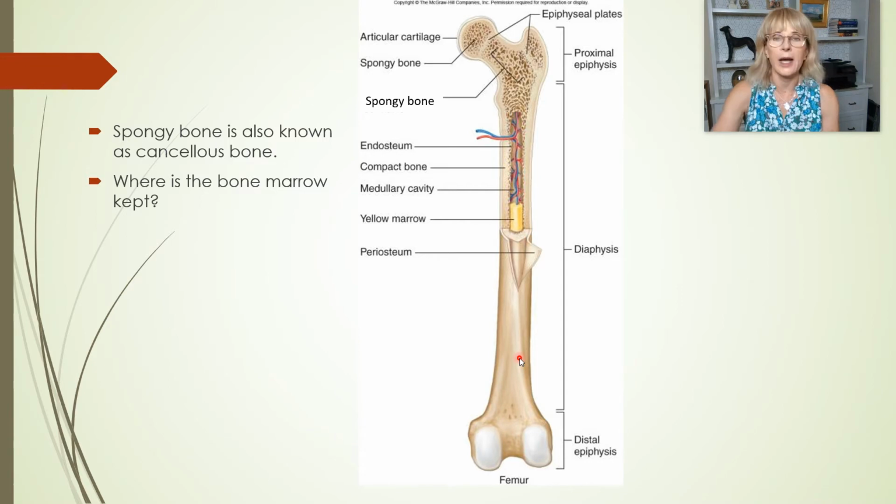The epiphyseal line. So right here and right there, the textbook has labeled these epiphyseal plates. This is AP 120. I'm not going to get into a lot of detail with you about the difference between an epiphyseal plate and an epiphyseal line. But if you go on to 150, they may make that point.